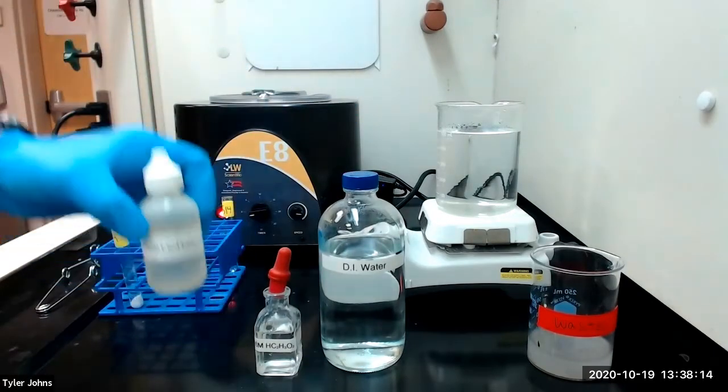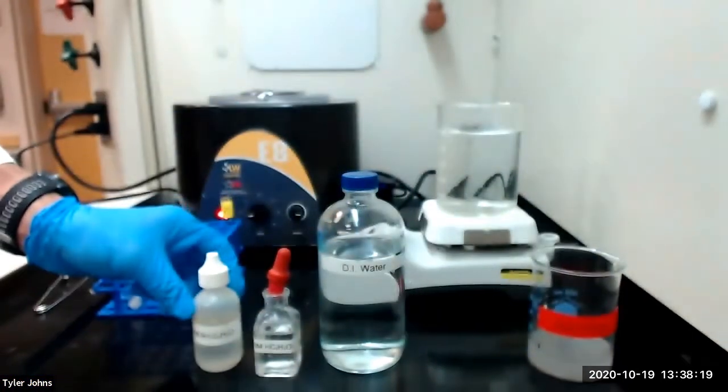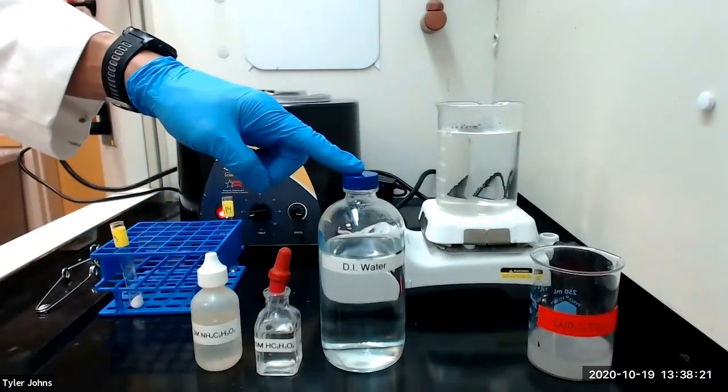We will then add five drops of three molar ammonium acetate and dilute the solution to one milliliter with deionized water.